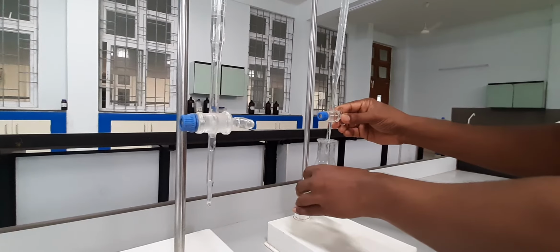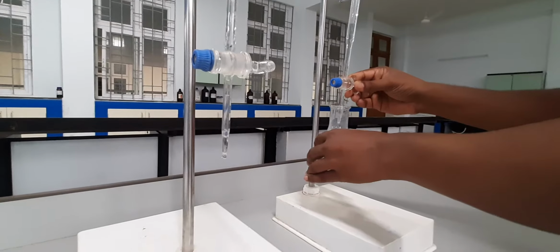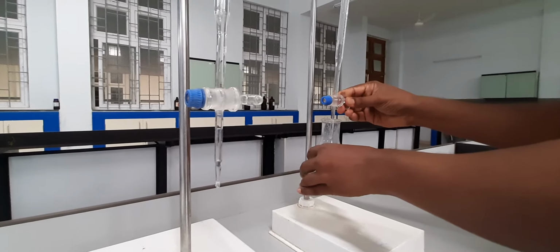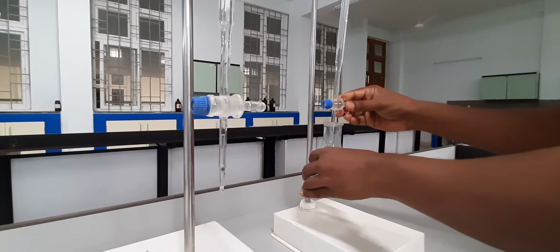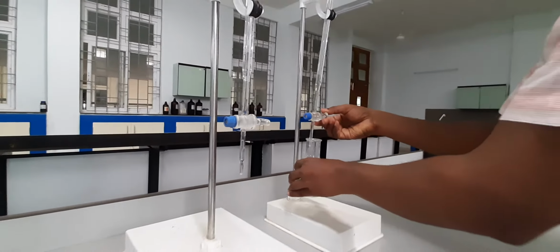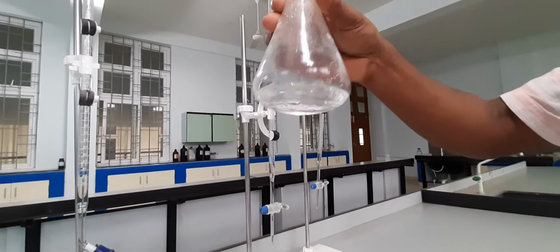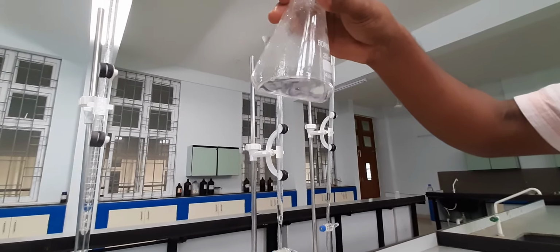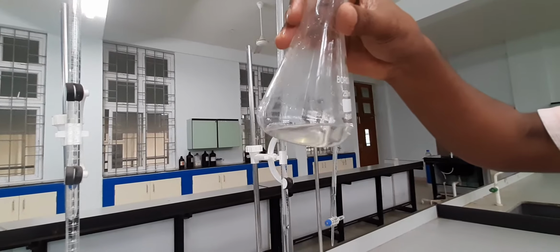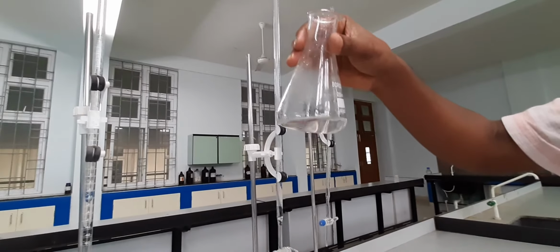So I will show you that these two liquids are nicely miscible with each other, and it is a nice homogeneous solution because they are nicely miscible. Okay, so I have taken 10 ml of chloroform also. You can notice here, the liquid doesn't have any boundary. So both the liquids, chloroform and acetic acid, are mixed together. You don't see any separation. That means they are nicely miscible to each other.